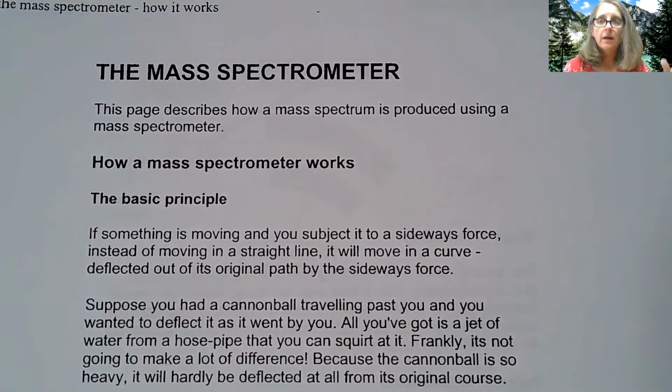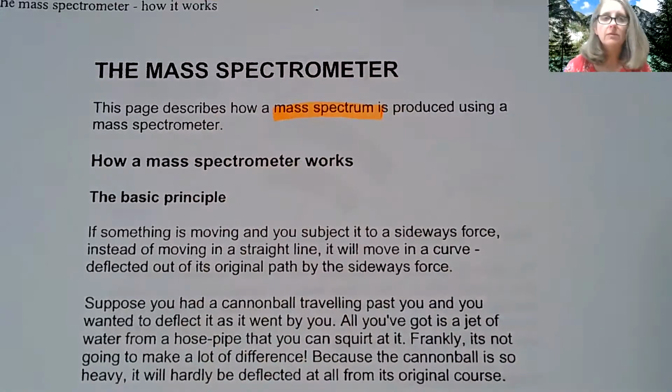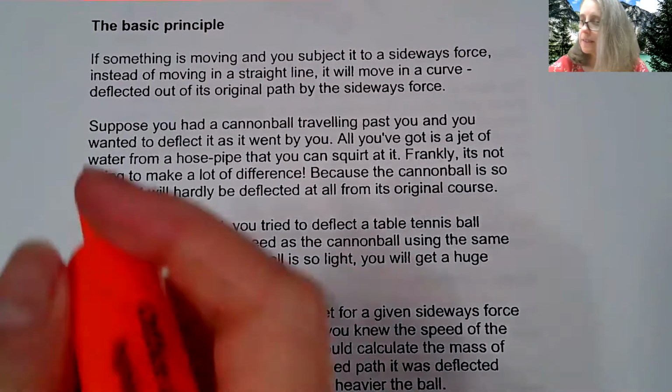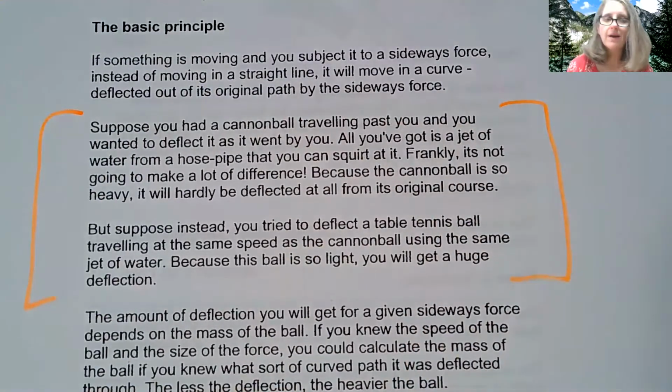So we know from IR, we get the functional group. Mass spec is going to be the one that gives us the mass, okay? So it's sometimes called the mass spectrum. And there's a couple different kinds of mass spectrometers. So I'm just going to give you a general overview, but there's many different kinds that you could get. So what I want you to focus on is these set of paragraphs here that describe how this actually works.